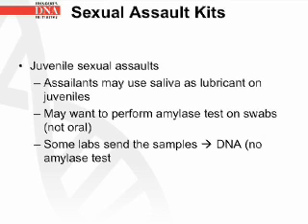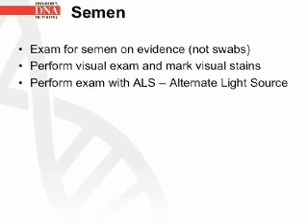For juvenile sexual assaults, assailants may use saliva as a lubricant on juveniles, so you may want to perform amylase tests on swabs, but not the oral swabs. Some labs send the samples to DNA without an amylase test.